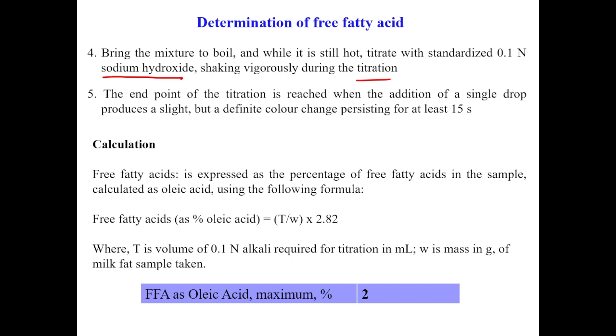Now the end point of the titration is reached when the addition of a single drop produces a slight but definite color change that persists for at least 15 seconds. So when you do the titration, the end point will be pink in color, because we are adding sodium hydroxide, and phenolphthalein attains a pink color in basic conditions. So the end point is indicated by a pink color that persists for 15 seconds.